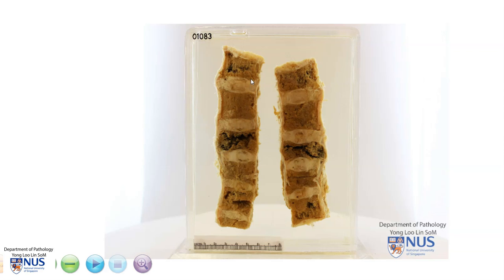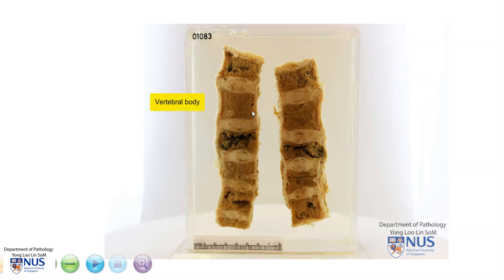This is a pathology specimen looking at the vertebral column, and we can see that it has been split longitudinally, and we're looking at the cut surfaces. Here we have the vertebral body and the intervertebral disc. The main pathology lies in the vertebral bodies, and we can see that there are several areas where the vertebral body cut surface looks abnormal.